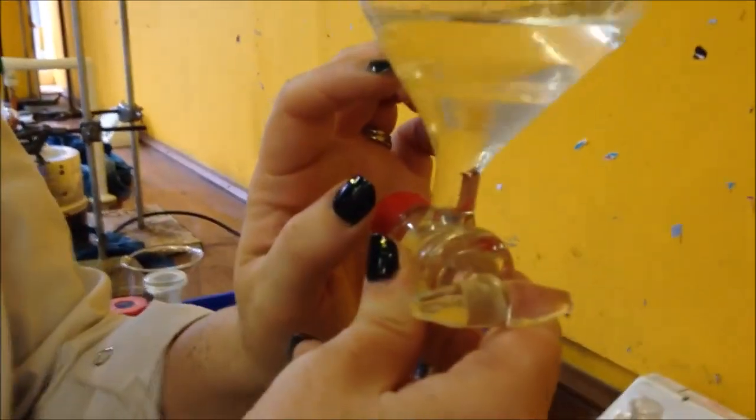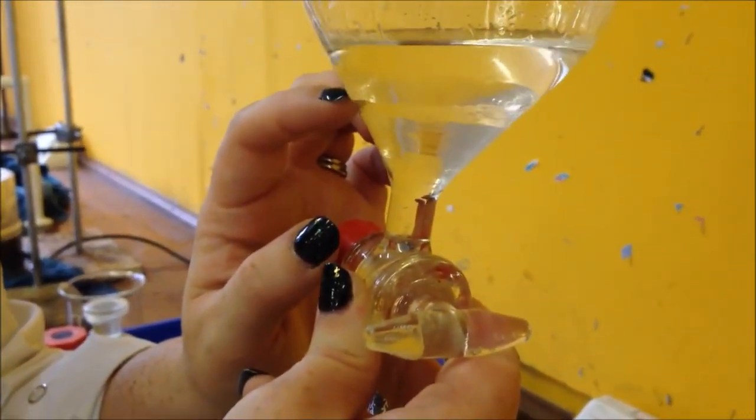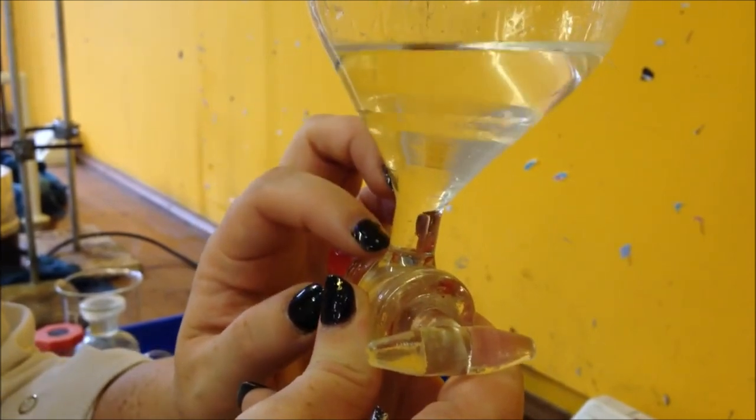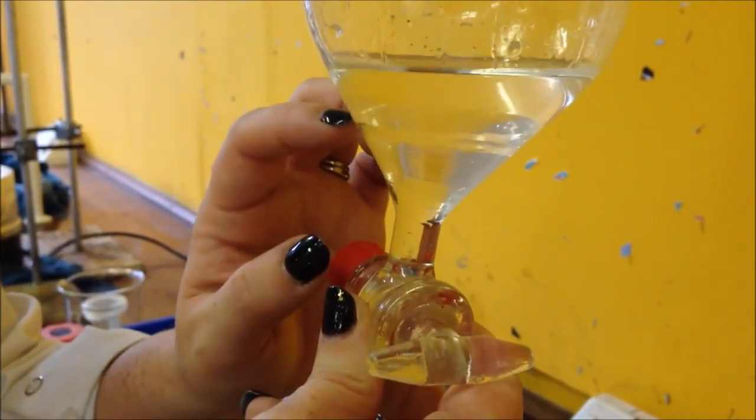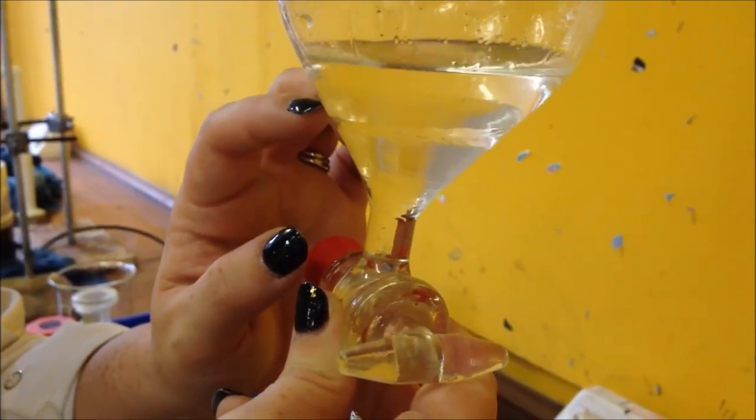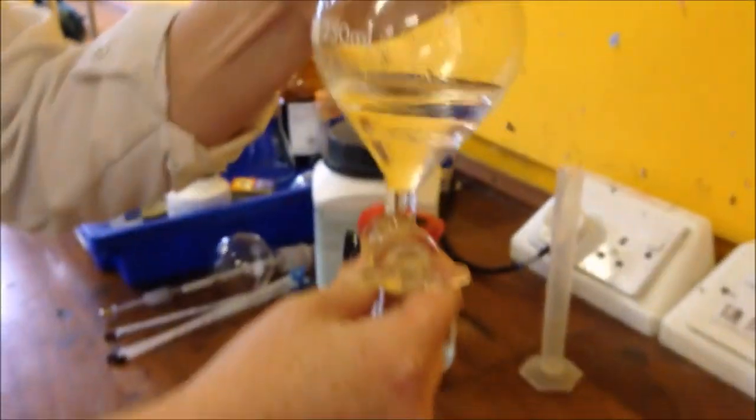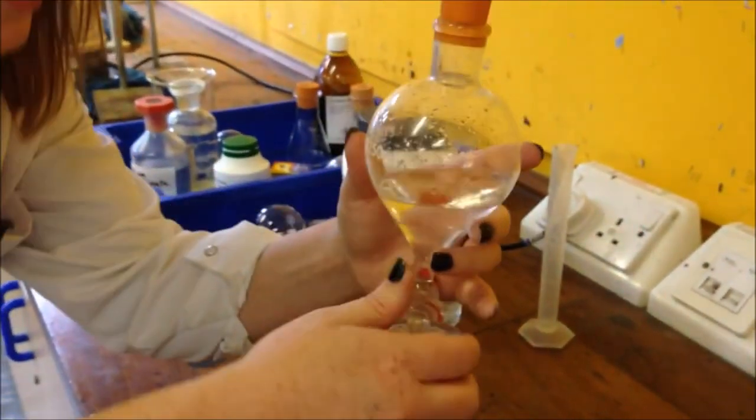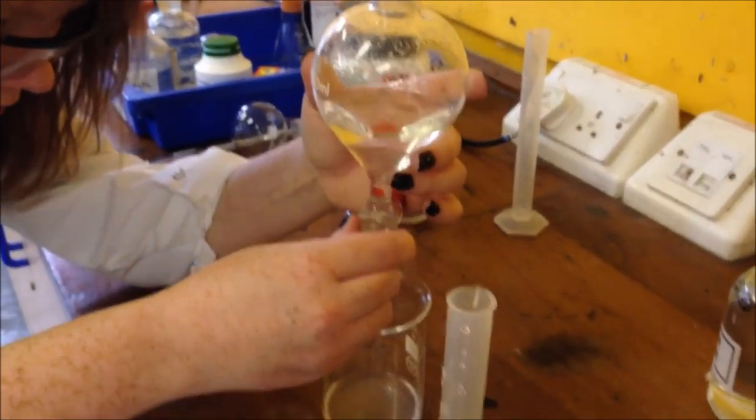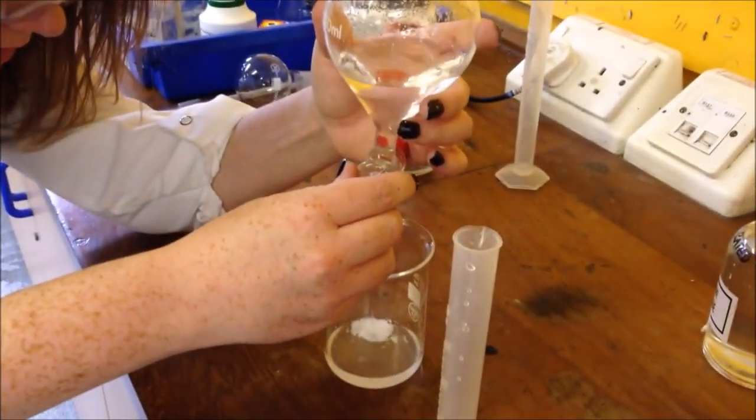So again we can see two layers separating out here. And again I want to discard the lower layer. So I'm just going to run this off until the layer has gone all the way through. So I'm just going to release a bit of pressure at the top and start running that down there.